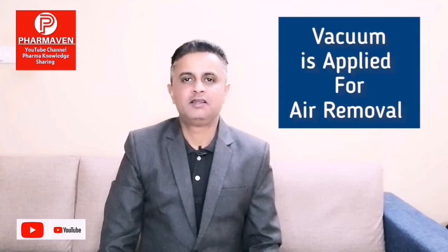So to remove the air, vacuum is applied. In hospital surgicals in the earlier days, a vacuum as low as 15 to 20 mmHg, that is less than 0.4 psi, was applied for 8 to 10 minutes to remove the air. But even with this deep vacuum, there is no surety that all air will be removed. So to ensure effective air removal, instead of a single deep pre-vacuum cycle, industry has adopted vacuum pulses, where multiple vacuum and steam pulses are applied for effective removal of air. This is a better technique than only one pre-vacuum pulse cycle.